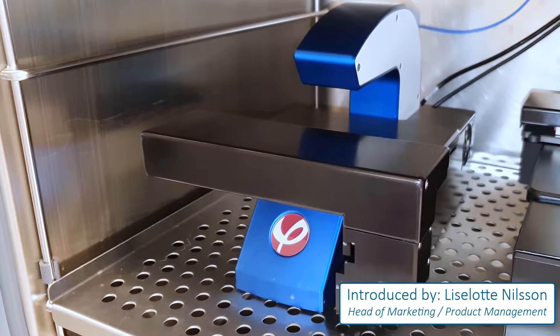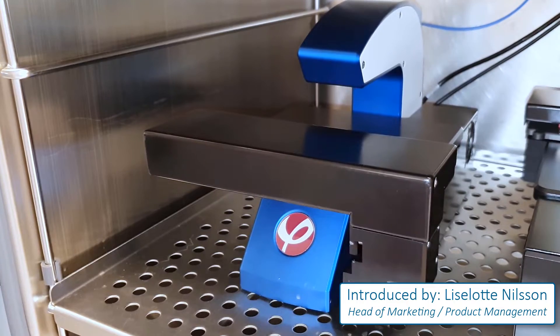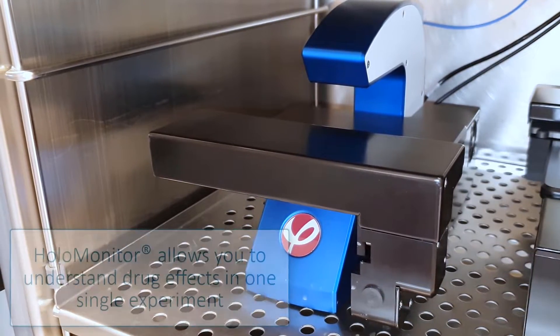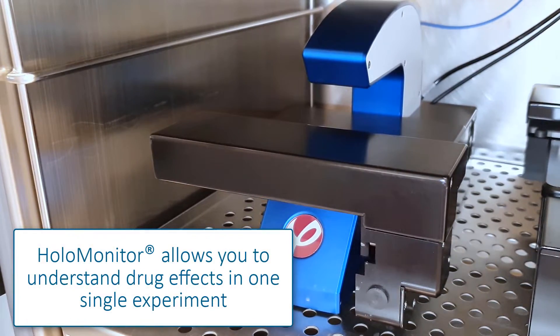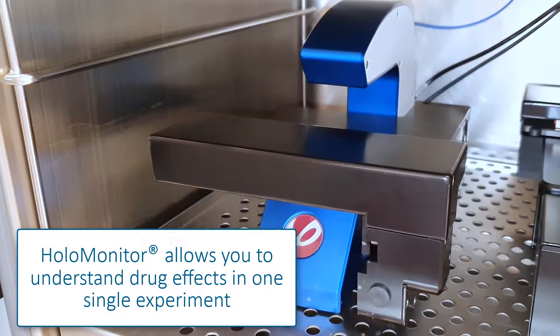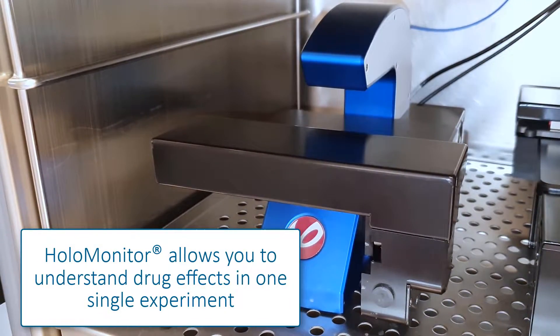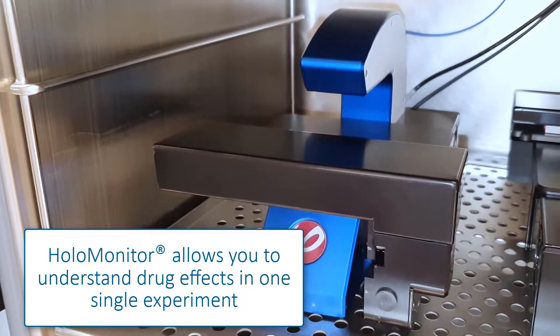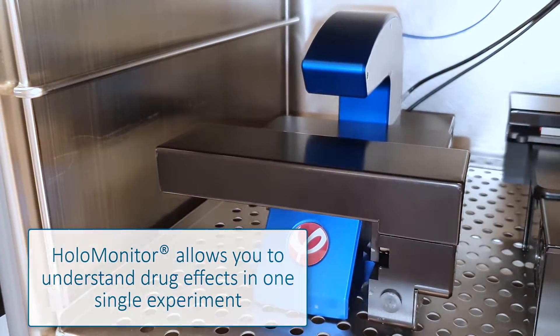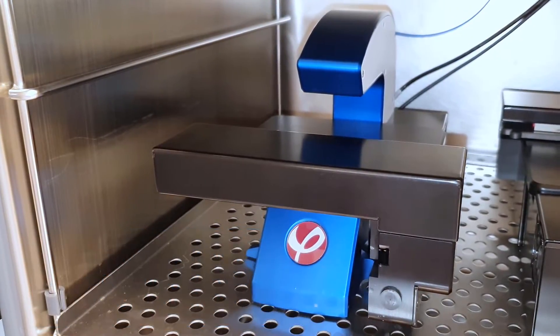When using Holomonitor for live cell imaging, you will, in only one single experiment, understand the drug effects on your living cells. Here you will learn how.